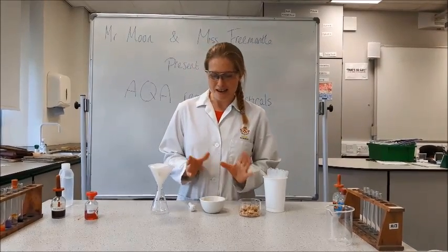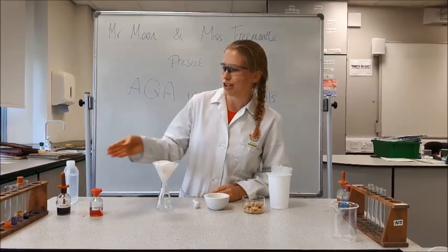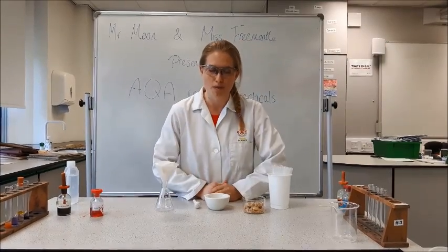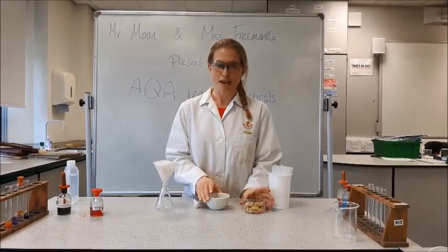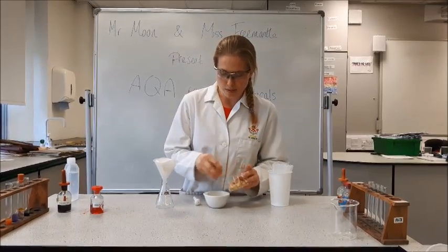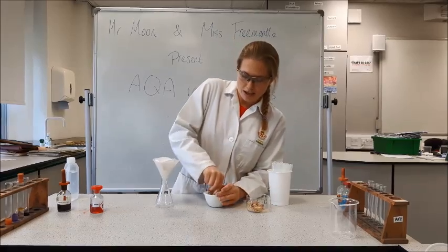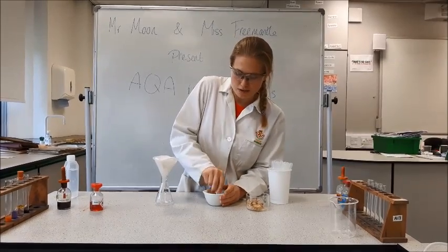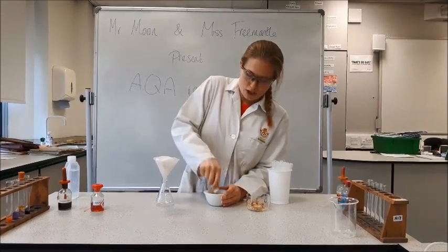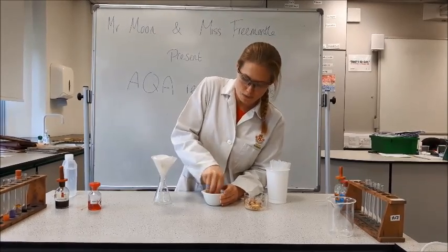Hello and welcome to the actual technique required for the food tests. Mr Moon has already showed us the positive results we are looking for, so what I'm going to do now is test some actual food. We've got here some biscuit. I'm going to put some into my mortar and grind it up with the pestle — give it a good grinding so you really crush up the biscuit and make a nice fine powder.